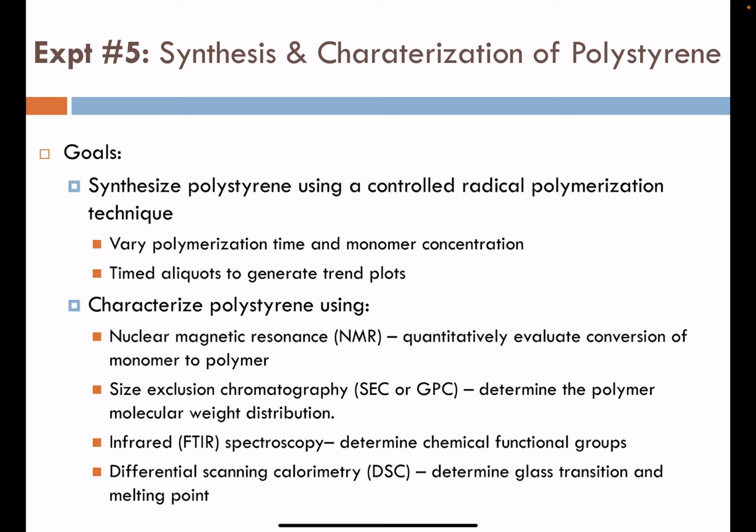In doing so, we'll aim to characterize the polystyrene using nuclear magnetic resonance, NMR, which is a technique that can quantitatively evaluate the conversion of monomer to polymer in this lab. We'll use size exclusion chromatography, a technique that can determine the molecular weight dependent on how the large macromolecules elute through a sort of nanoporous packed column.